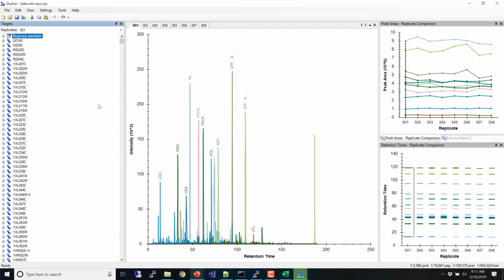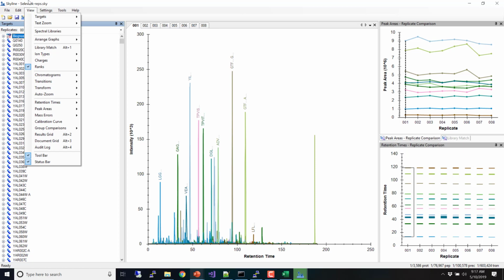Okay, so now let's go ahead and look at the CVs. I showed you before my R scripts that showed the CVs, and I thought that was so useful that I wanted to get it into Skyline. So we can go to peak areas, and we have 2 histograms. Basically, those 2 histogram plots that I showed you in my R-generated code, I then had an intern implement over the summer, and you can get either.